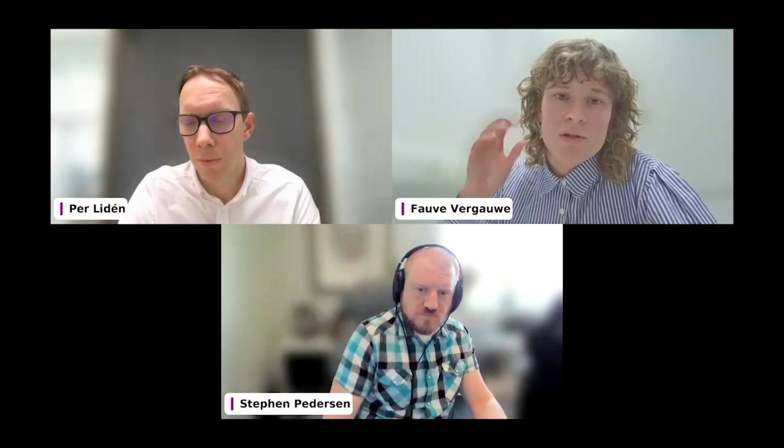I think it might be possible, but if you have any liquid around it, this really makes sure that the transfer of the heat is a bit more, how do you say, I cannot think of the perfect word, but it's easier to measure. You will have a higher signal, but it might be possible. Even if you want to test the biofilm on a wood, maybe you can just put some liquid around it so the transferring happens easier. But no, I don't have any experience with that particularly.